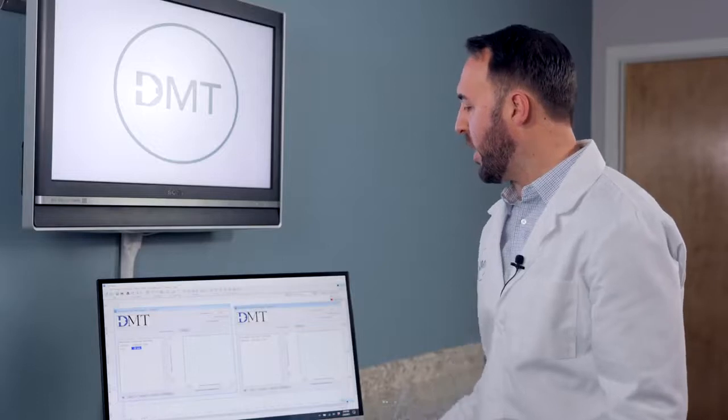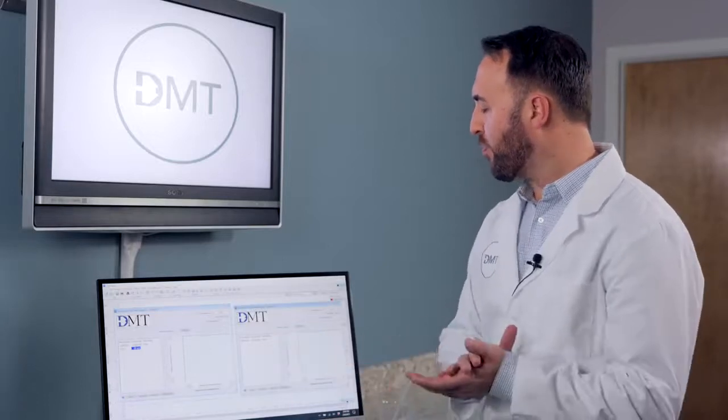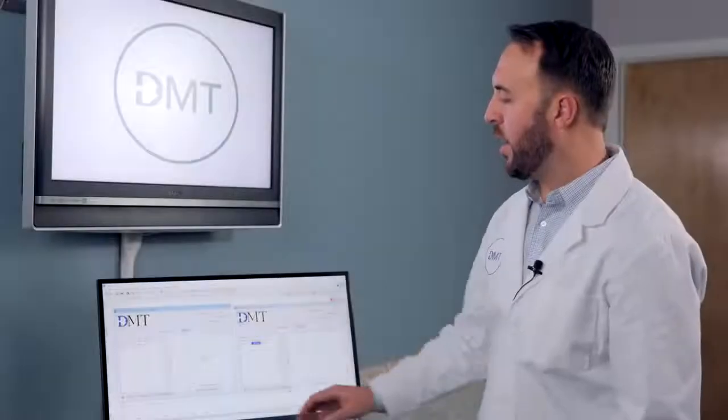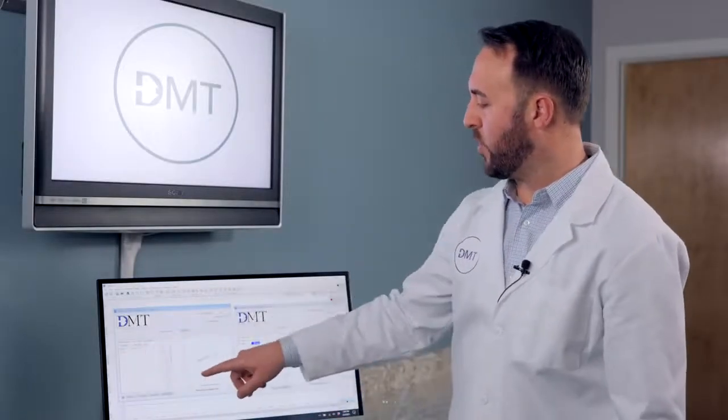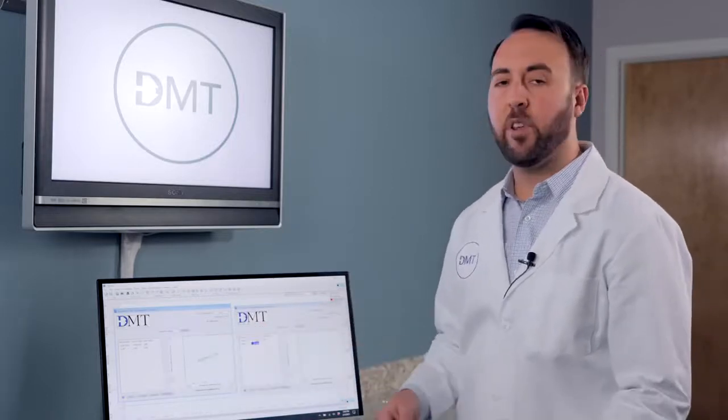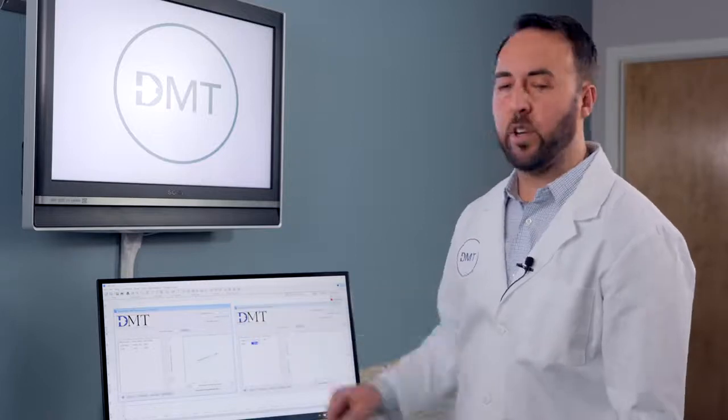And since the second point is done, I can now go to channel 2 and do the same thing again. And now you see on channel 1, since that second point is done, we now have information on our graph. And after the next point, we will start to see our best fit line.